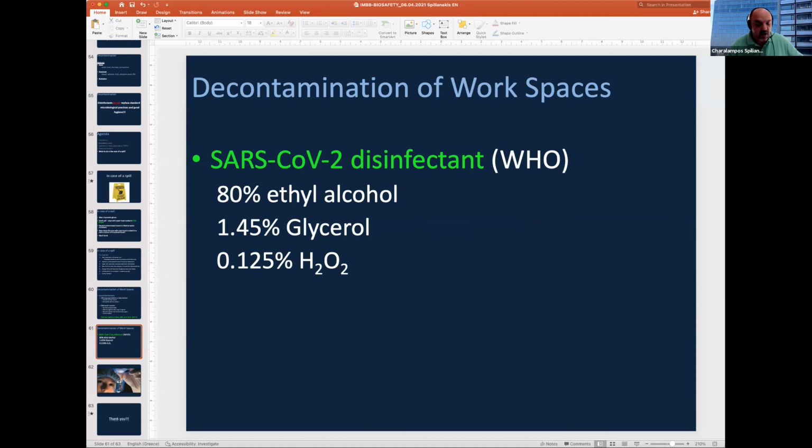Sure, definitely. Now, if you work with coronavirus, it is my opinion that you would work at least in a BL3 laboratory, if you work with live virus, because it is known to be airborne transmitted. That's what makes the difference going from a BL2 to BL3.